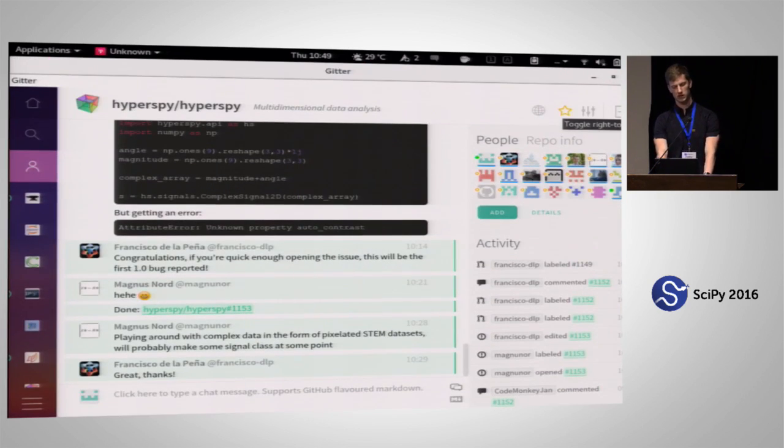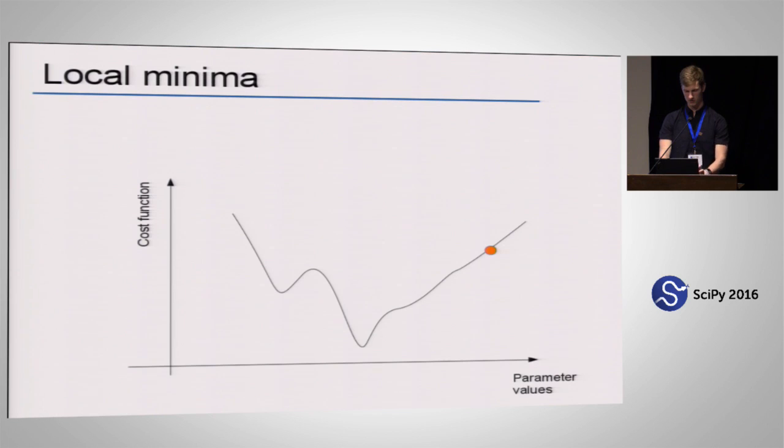That actually brings me to a problem that's very common in all optimizations, which is the local minima problem. What happens is when an optimizer is given a cost function, represented here by the black curve, and a starting guess as the red ball, what the optimizer usually does is just go downwards, down the hill, right, until it finds the lowest point, and that's your solution.